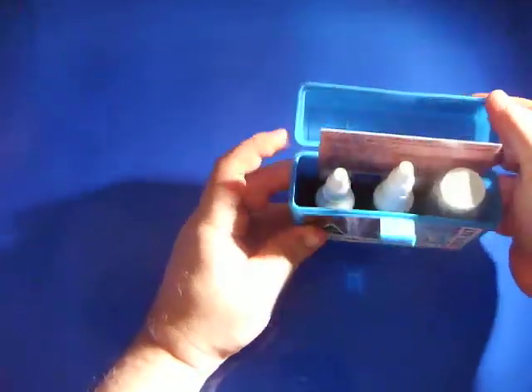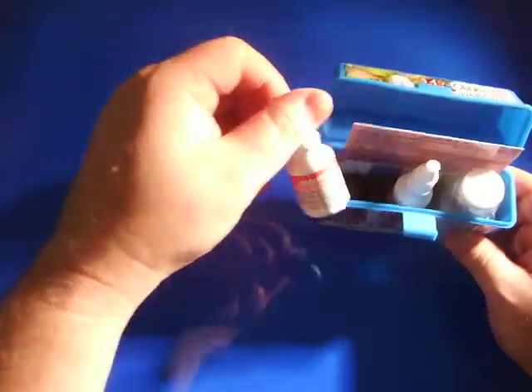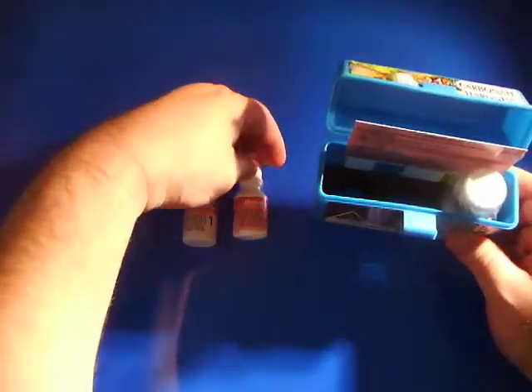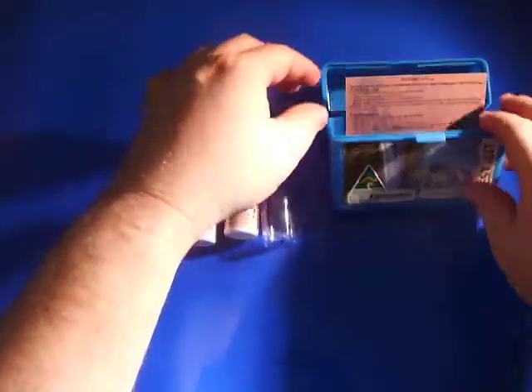Basically the kit contains your Reagent 1, Reagent 2, the vial for where you put the water in to do your test, and your instruction manual.